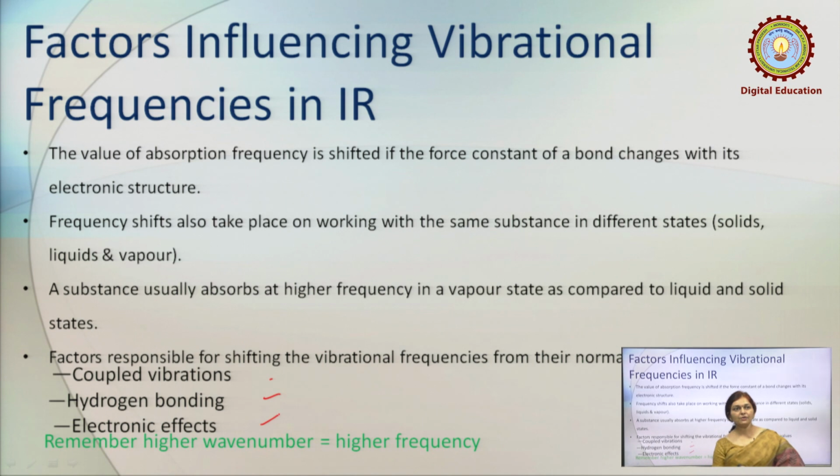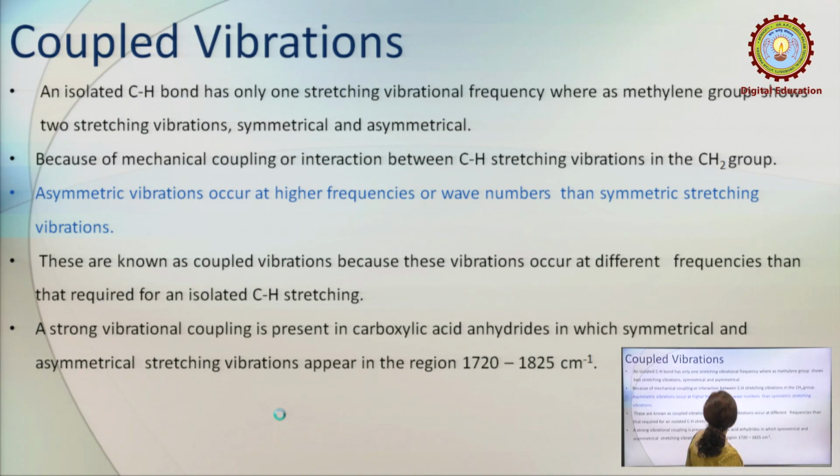Remember, higher wave number is equal to higher frequency. If the wave number of absorption increases, it means frequency also increases. Let us discuss these factors one by one.